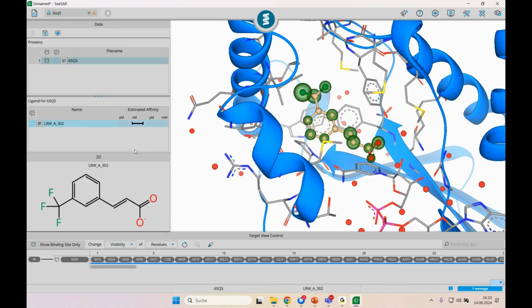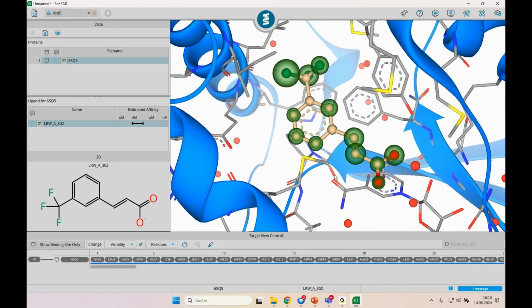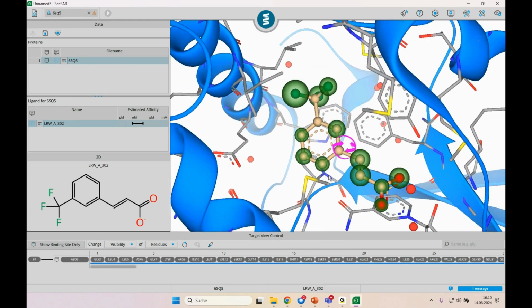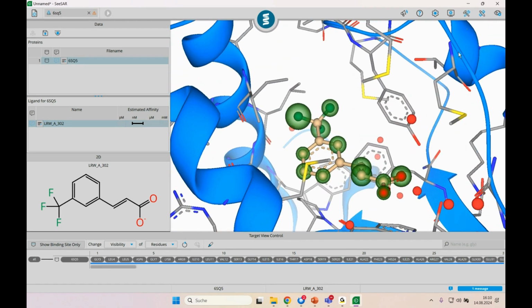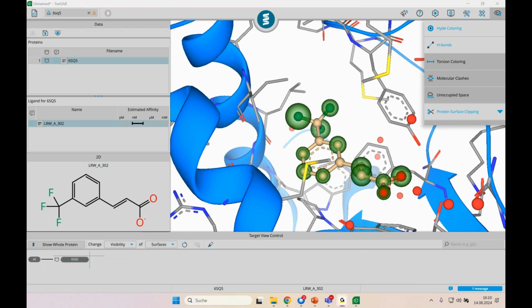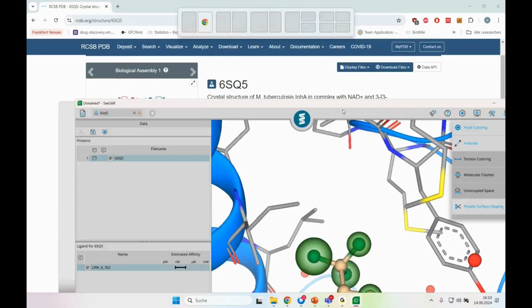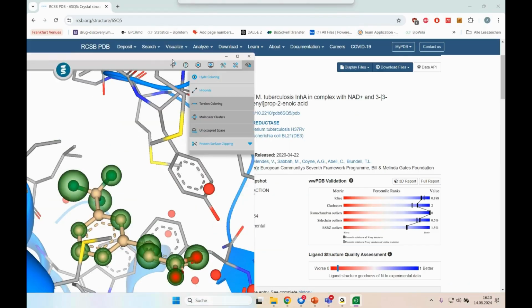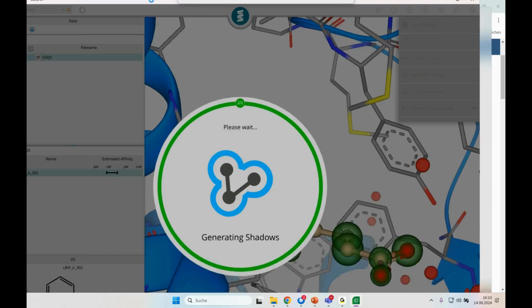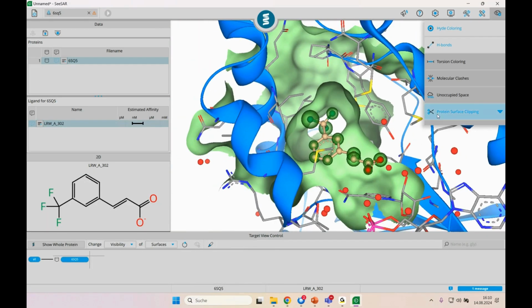I will now again zoom in a little bit on the structure itself. What do I see here? Just to talk a little bit about the interactions, maybe I will also switch on the binding site here. Visibility, surfaces. I have to adjust it here a little bit because it always interferes with the GoTo interface. Right. So the binding site is there.